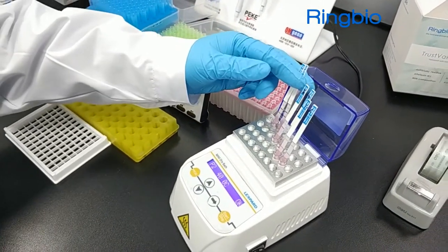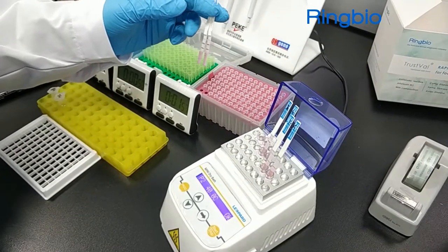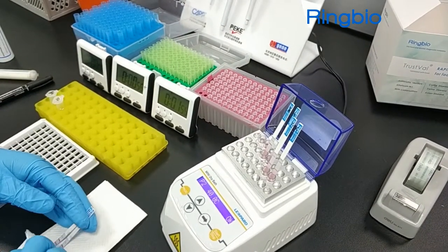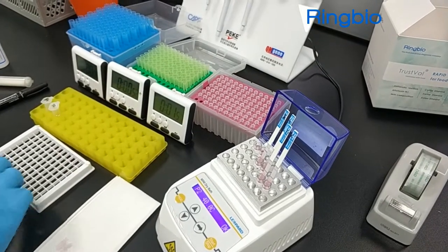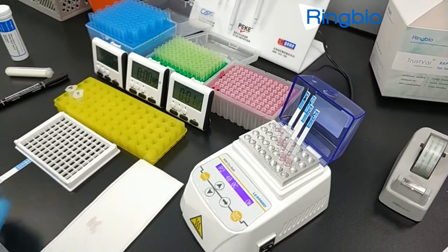After the second incubation, take the test strips out from the wells, remove the sample pad on it, make proper marks and determine the result according to the kit instruction provided in the kit.